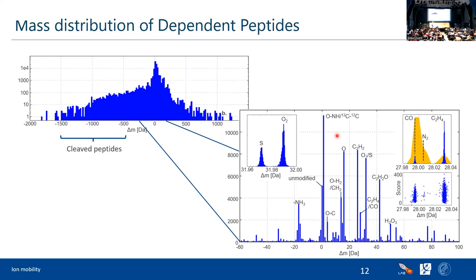First of all, thank you for the question. That's a very interesting topic that's often overlooked, and it's actually directly connected to the DIA search. When standard Andromeda search is performed, and we construct our target decoy database from the FASTA file, we construct it without any intensity information. So the peaks in the target decoy database have the same intensity. They just differ by m/z. And we then map it against the MSMS spectra in observed space. And obviously, if we don't have intensity information in target decoy space, we get an artificially worse Andromeda score than we would get if we had this intensity information.